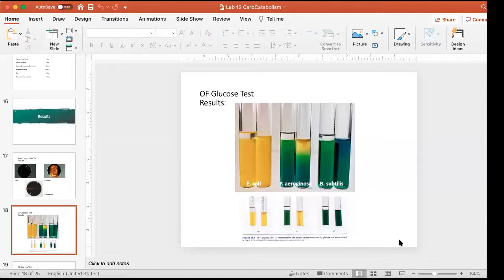So the bacillus is alive in there, but it can't do aerobic cellular respiration. We've learned something about it. We've learned that it can't do one of those 3 pathways that we've been talking about. Now let's look at the other bacillus tube. This one is green. The tube with the oil over it has stayed green.